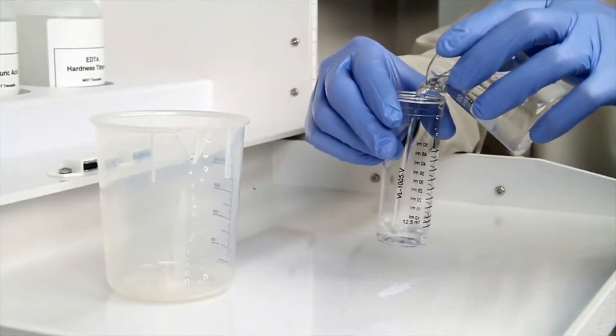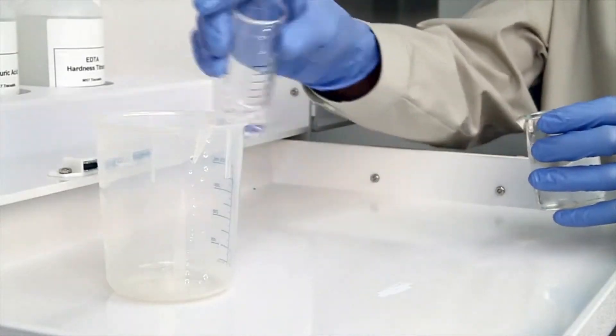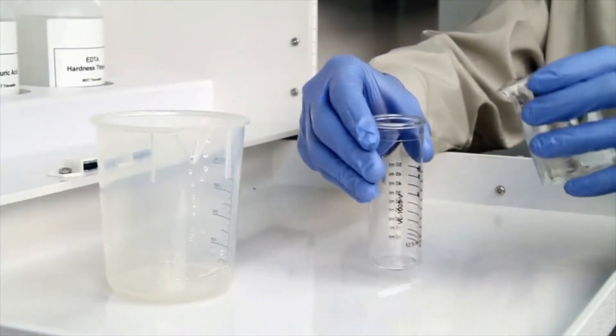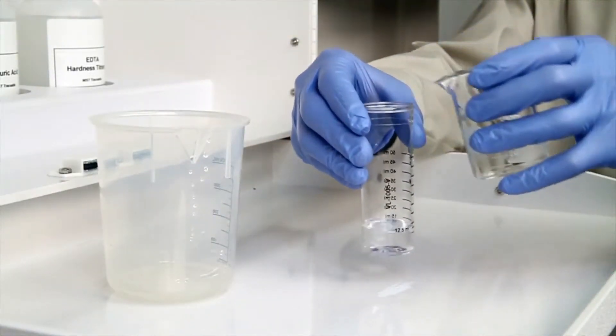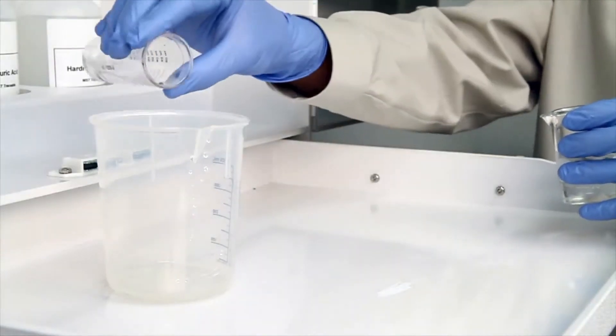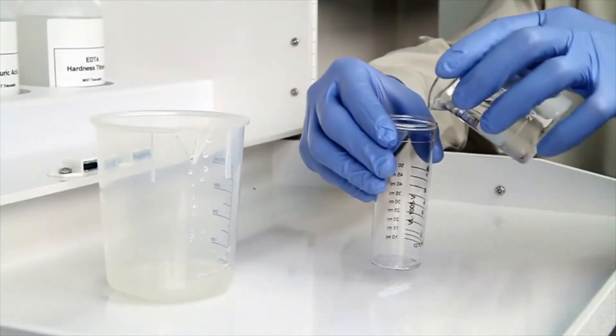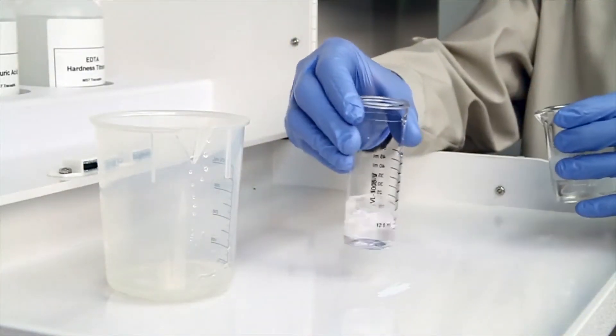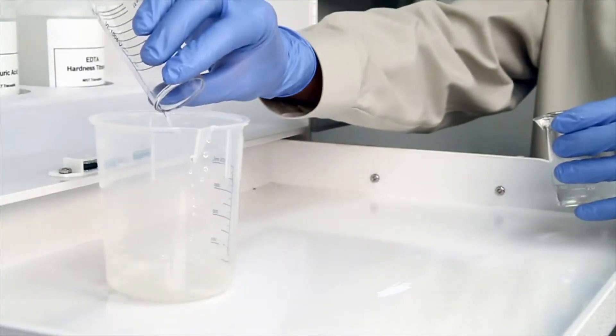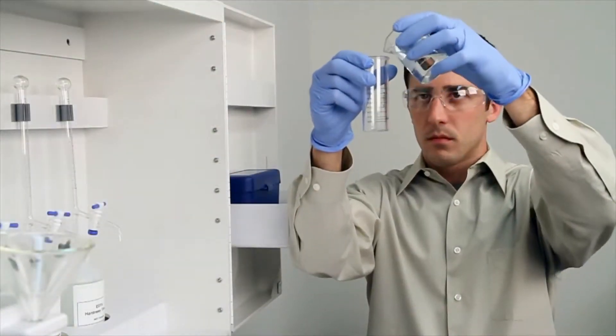The first step according to the endpoint ID procedure is to gather an accurate sample. The smallest change in sample size will lead to inaccurate results. Before gathering your sample, it's important to rinse the vial three times with the sample to be tested. This minimizes the chance of contamination from a previous titration.